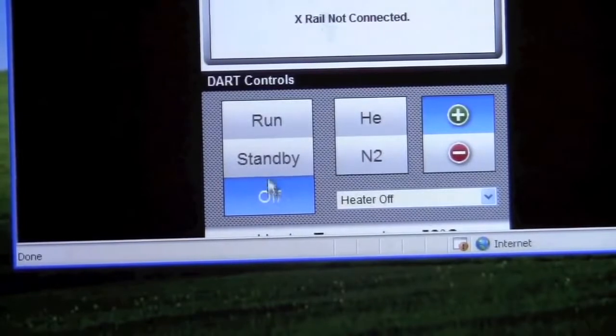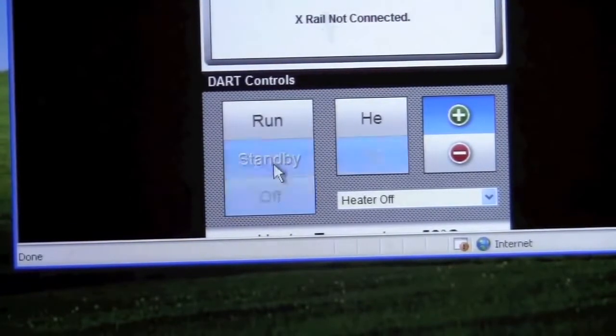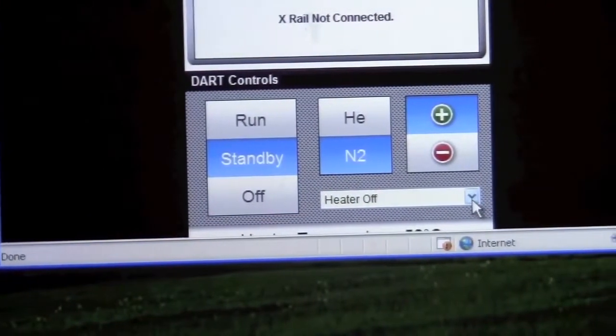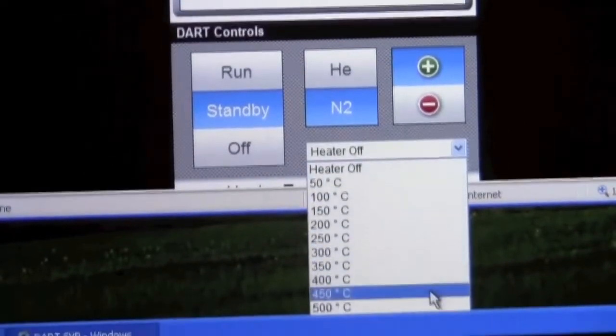The first step would be to put it on standby and then to turn the heater on to an appropriate temperature.